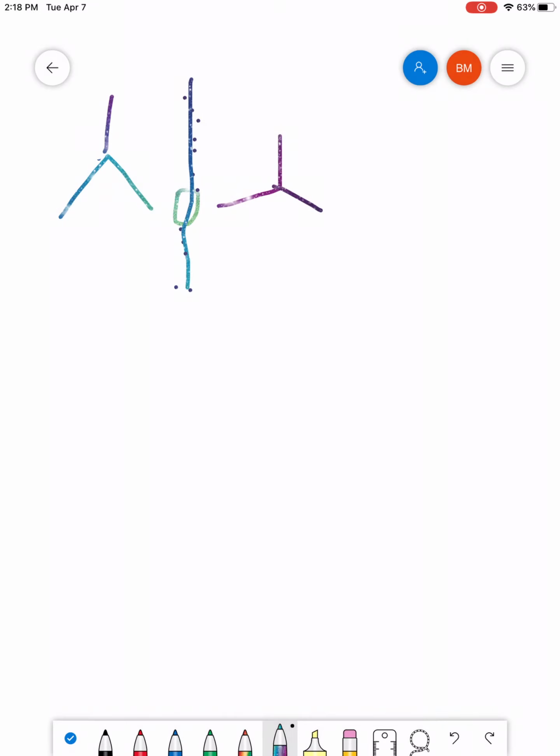Okay, sorry about that. All right, so we do have 2 identical halves here, and if we're looking at the places where we do have H's, we have one there, one there, here, here, and here. So again, if you looked at the individual H's, you could see that you have a group here that's unique to the one in the middle, right?